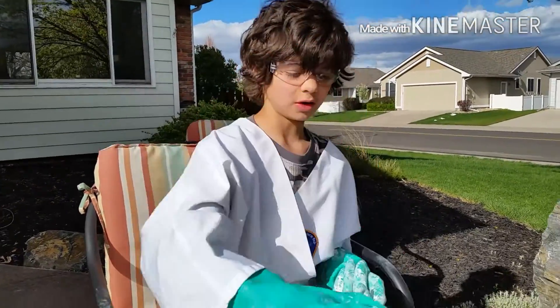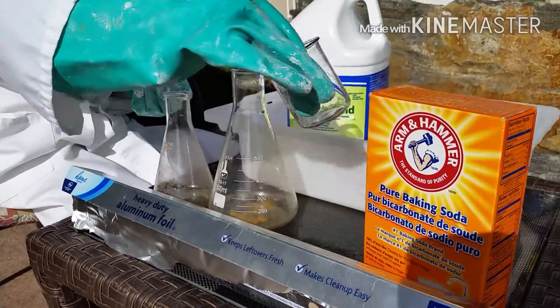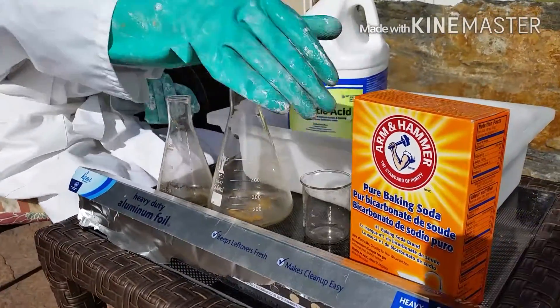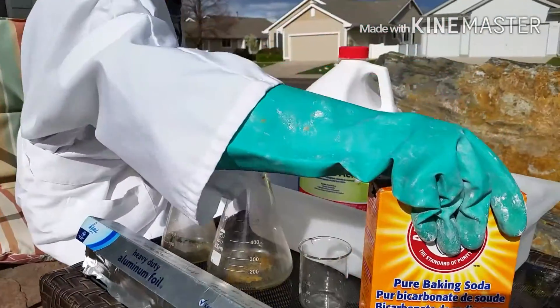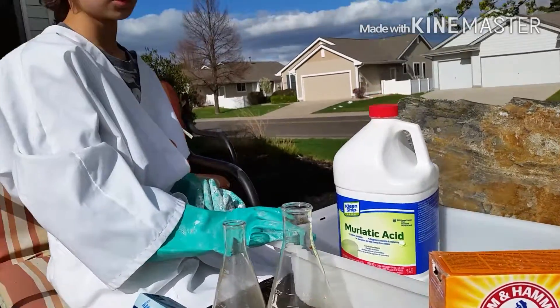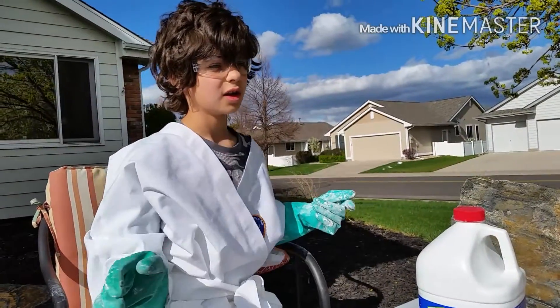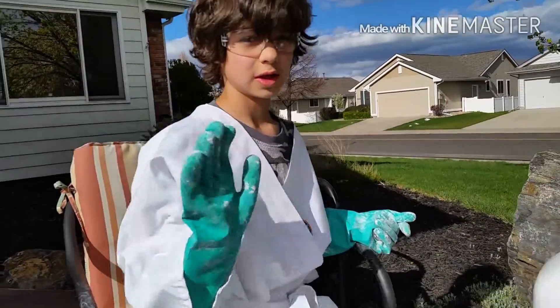We're using Erlenmeyer flasks to do it side by side and a beaker to measure. It's always a good idea to have baking soda on hand because it's a very strong base and hydrochloric acid is an acid, and you can neutralize it with that to be safe. Let's get started.